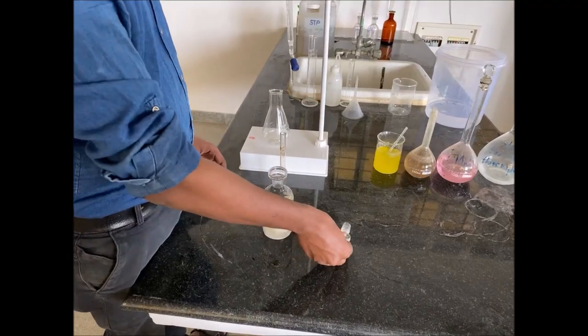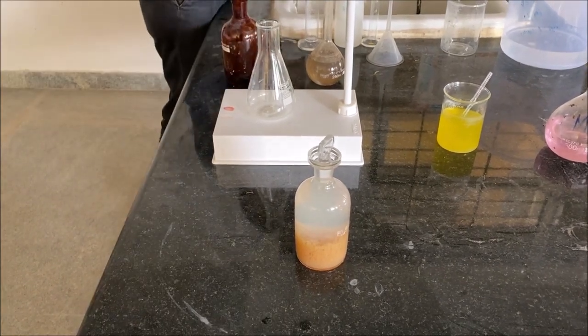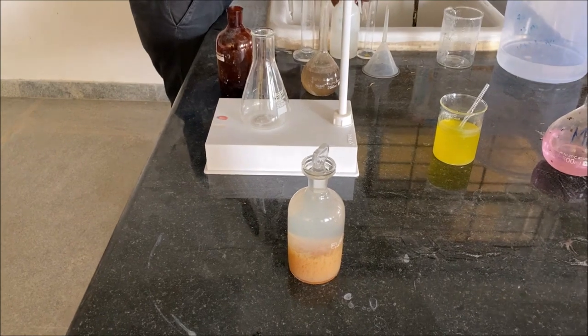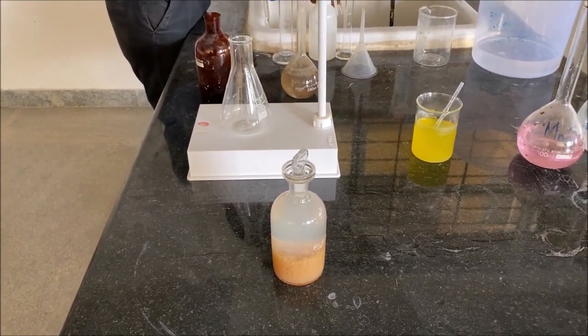For the BOD bottle containing STP sample, we can see the settlement of precipitate. So to this, 2 ml of concentrated sulfuric acid is added.